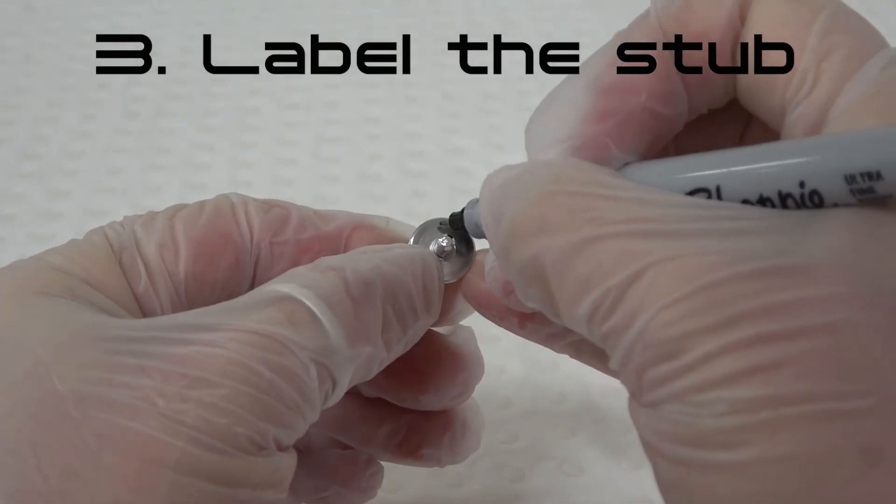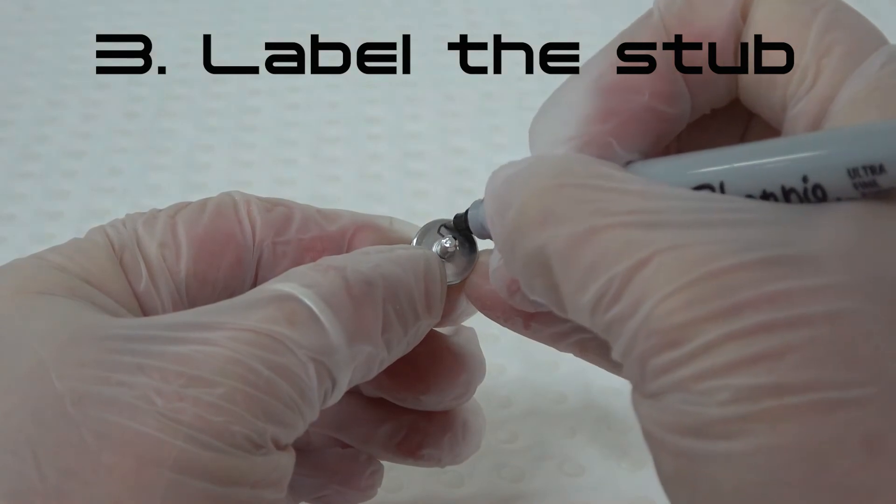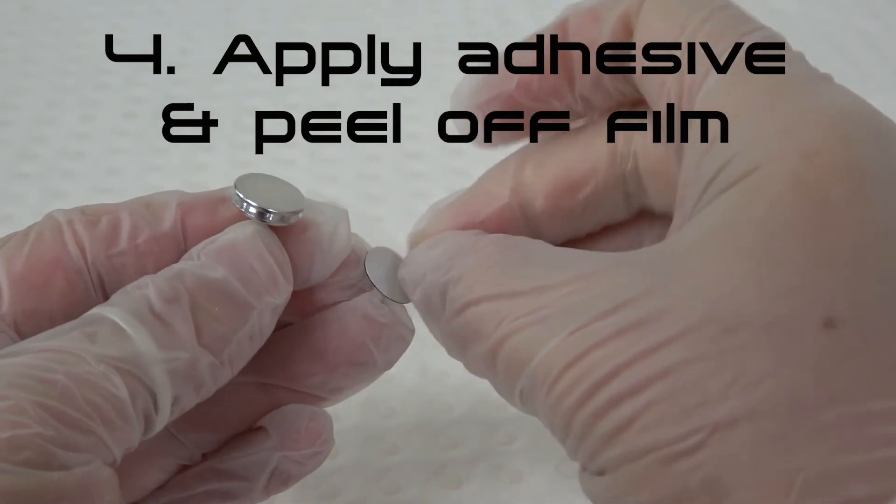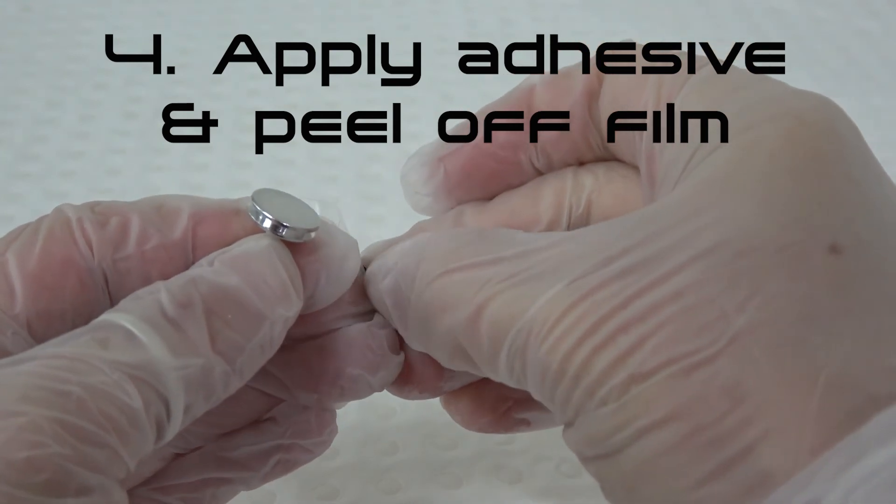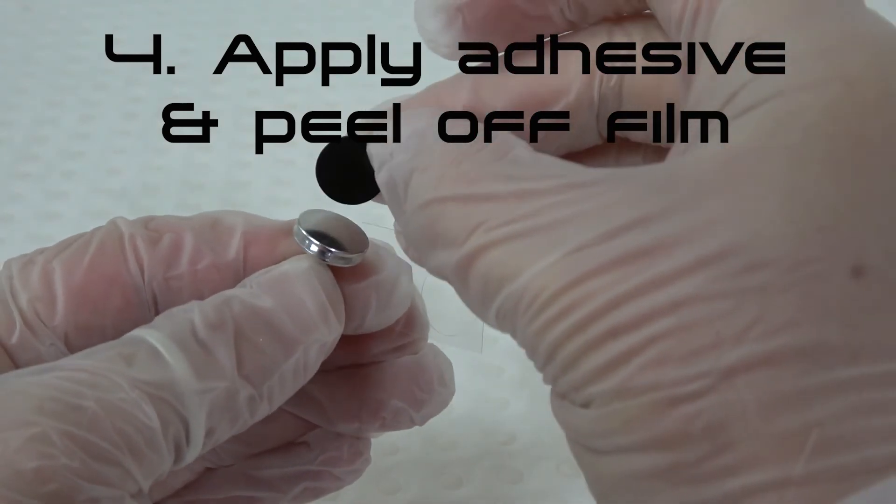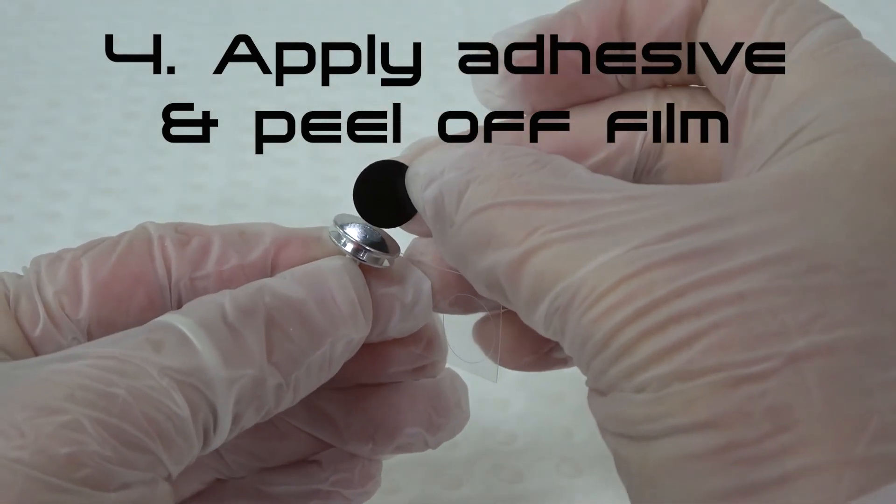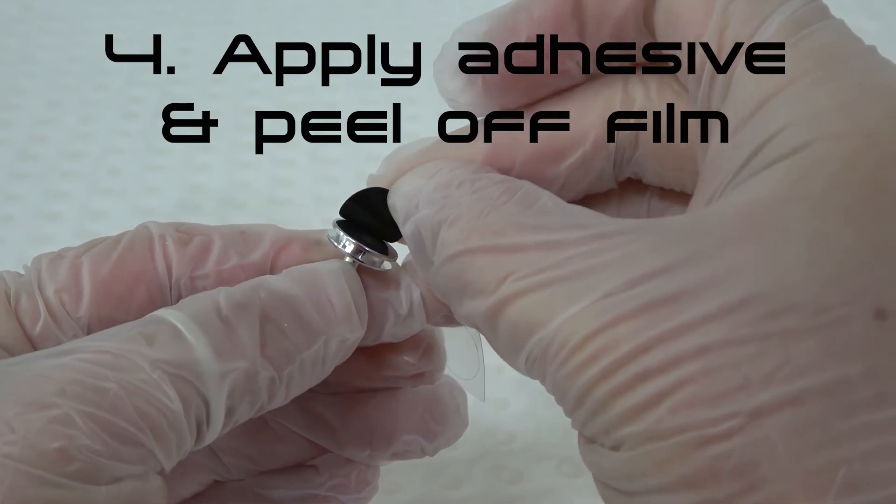Step 3. Label your SEM stub with the sample name or ID code. Step 4. Place one side of the double-sided adhesive onto the SEM stub. Remove the protective film to expose the surface of the double-sided adhesive.